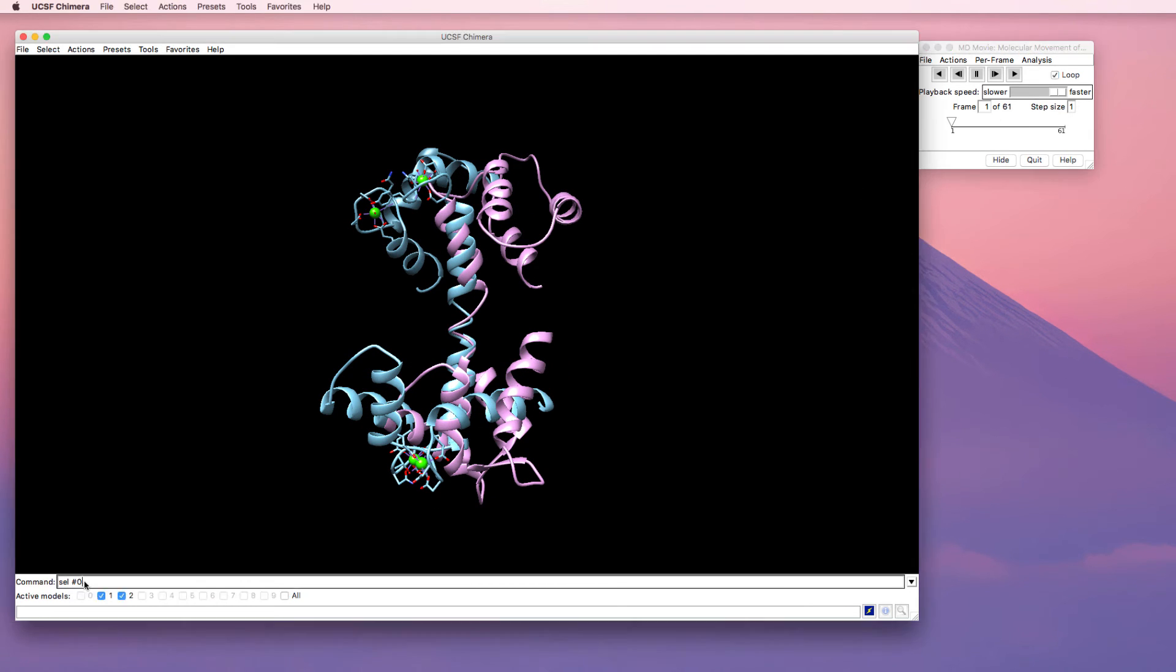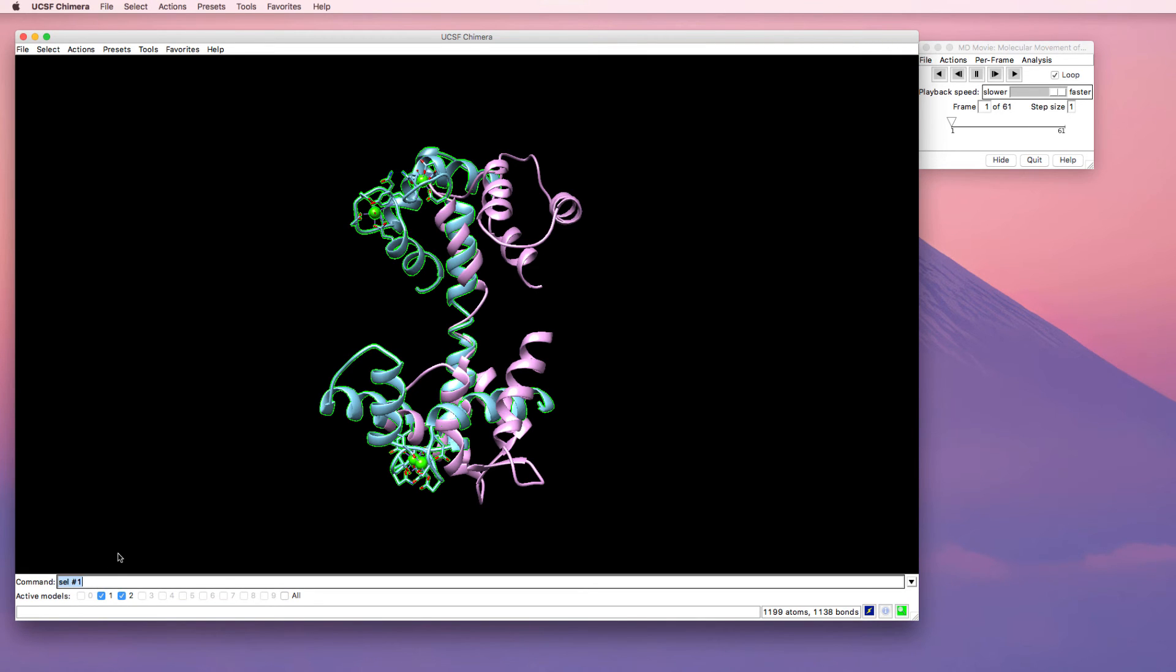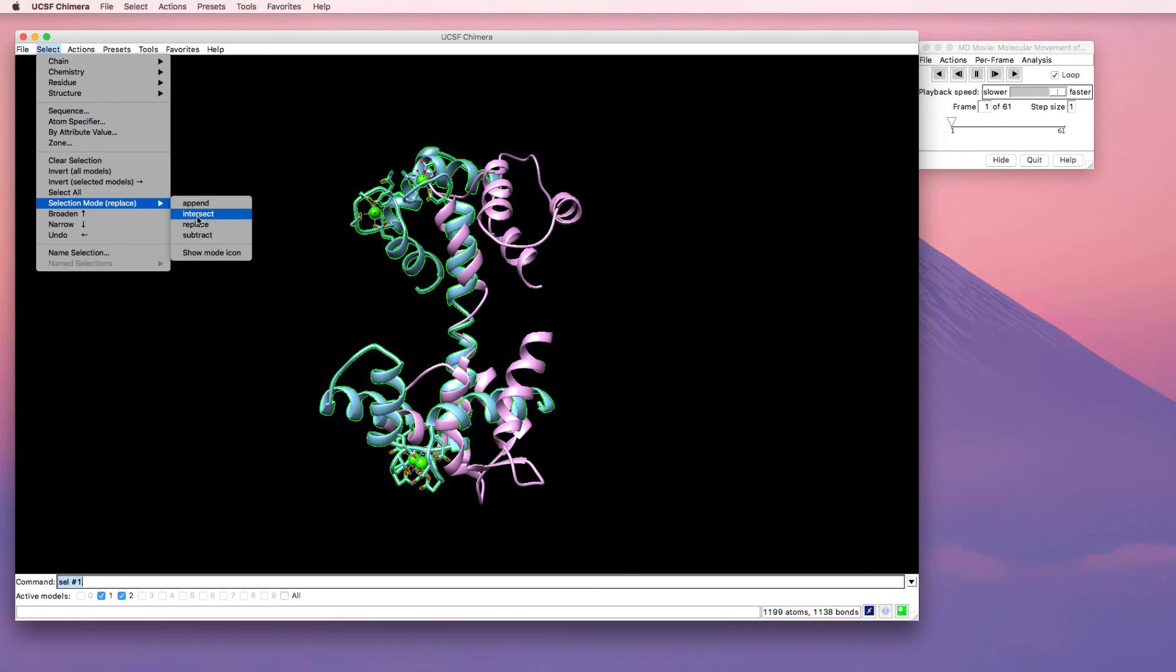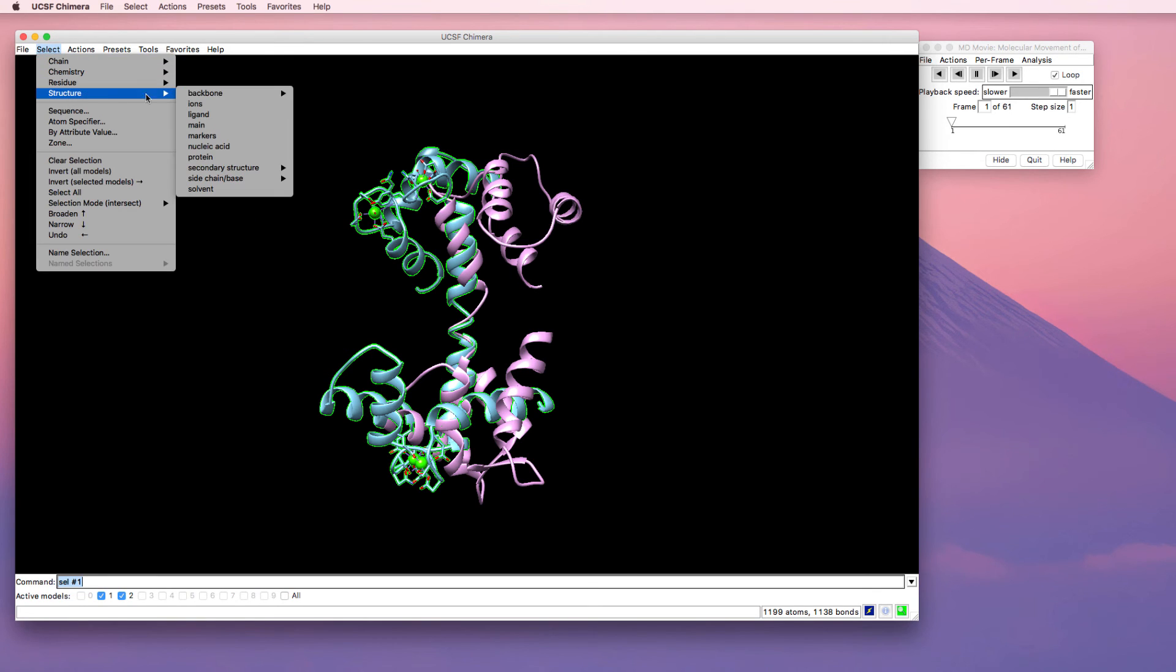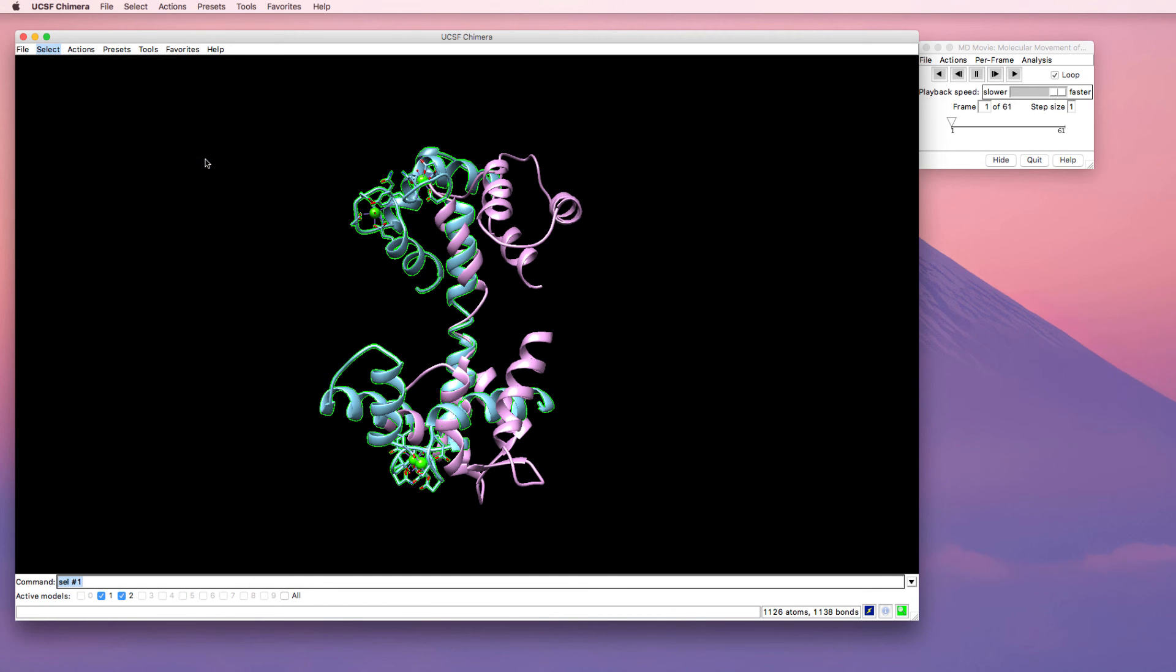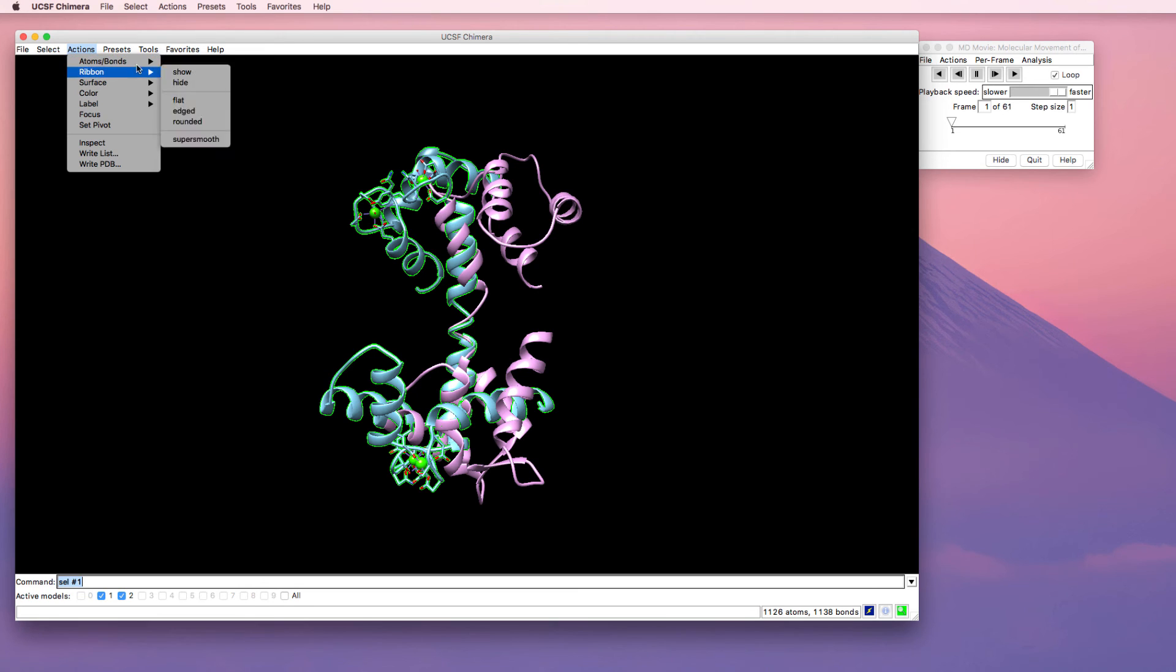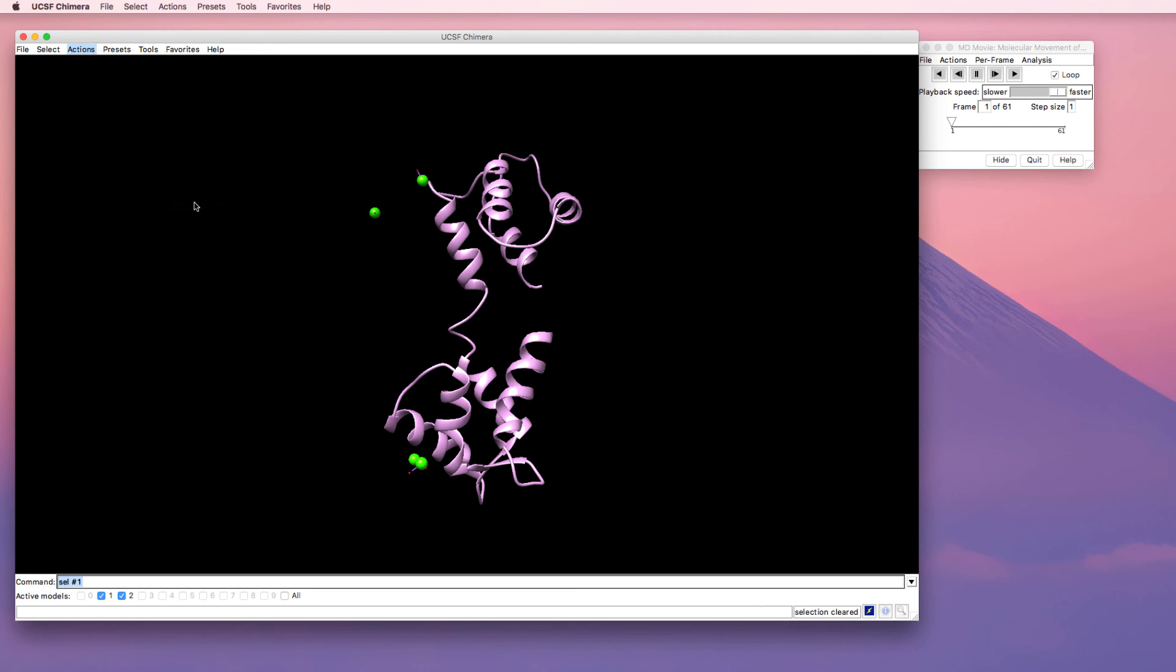For structure number one, which is the halo form, I don't want to delete the entire structure. I only want to delete the protein. So I'm going to select just the protein part by changing my selection mode to intersect and then selecting the protein. Now I'm going to delete those atoms. So the only part of structure number one that's left is the calcium and its bound water.